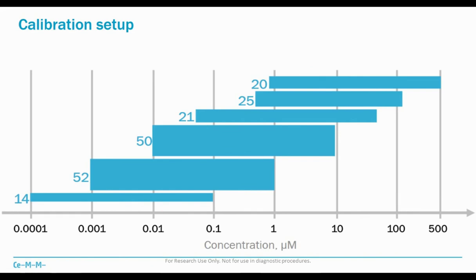And this really allowed us to set up a nice and easy workflow for how to mix standards together. Now we can adapt the range for every single compound separately. We can have some premixes that take care of solubility issues, and then at the end mix everything together, and we have this one big mix that we use for calibration.